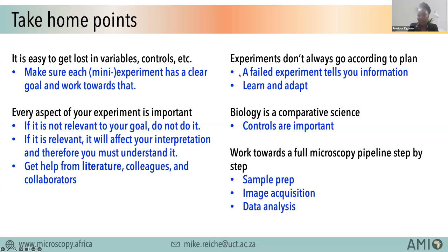Thank you, Mike. We have a question from Chukunonso, who said, you mentioned that you need to know how many samples that we need to achieve statistical significance. I know that for lab rats, a minimum of 4 rats are adequate, but for histological samples, how many sections would one need to assess to achieve statistical significance?